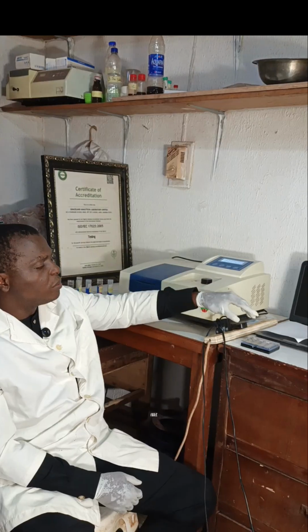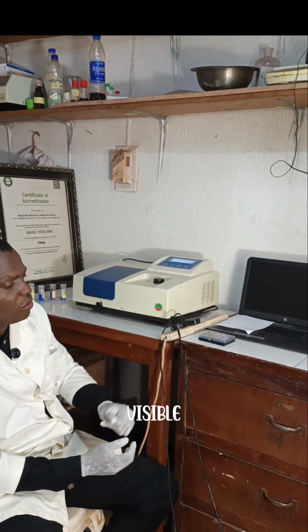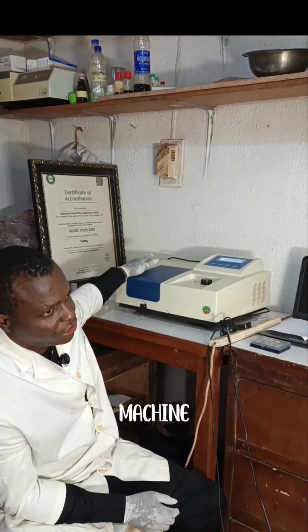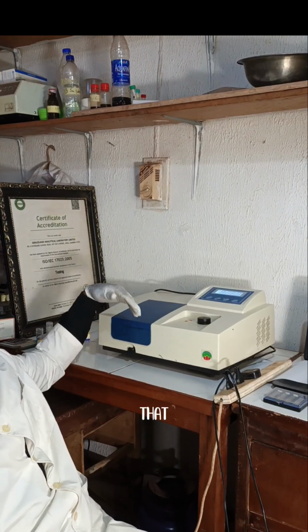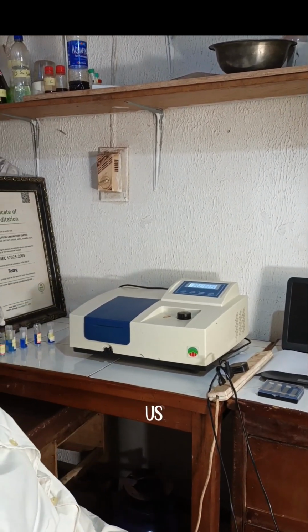Now, for us to be able to understand how to use a UV visible spectrophotometer, the first thing we have to do is to turn on the machine, which we have already done prior to starting, so that it will give it time to preheat. Then the next is for us to have our standards.